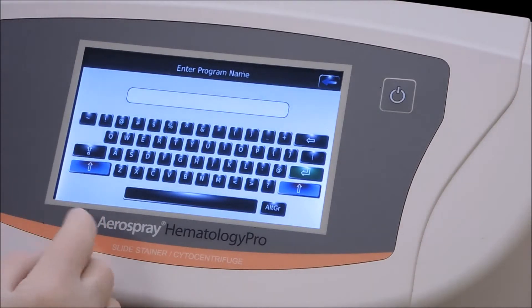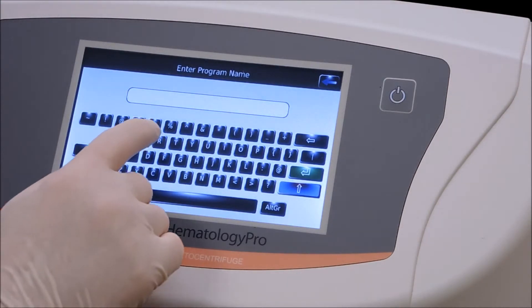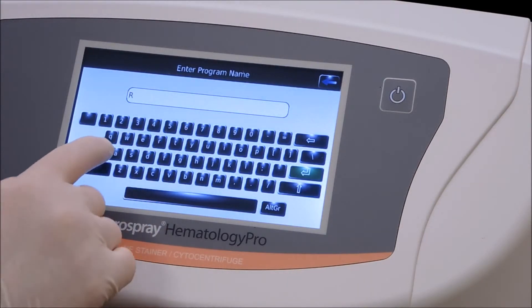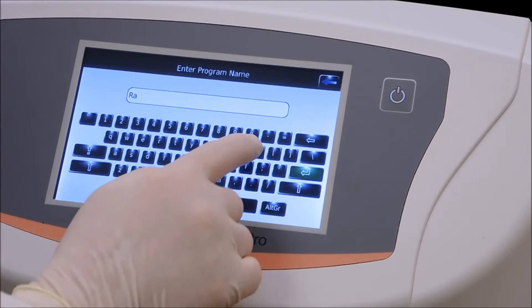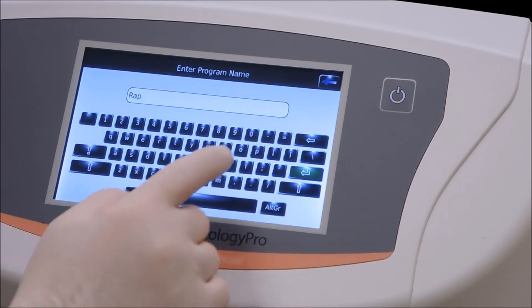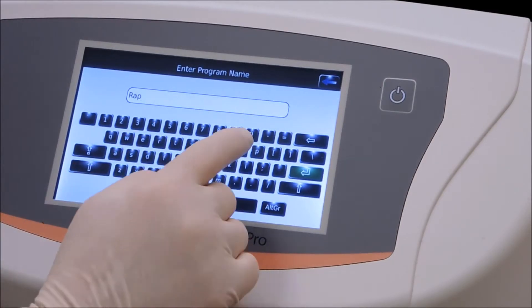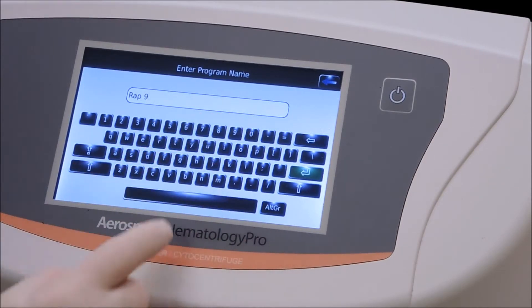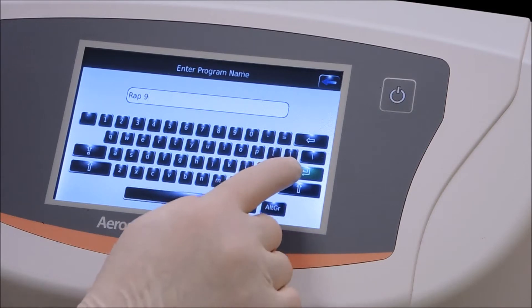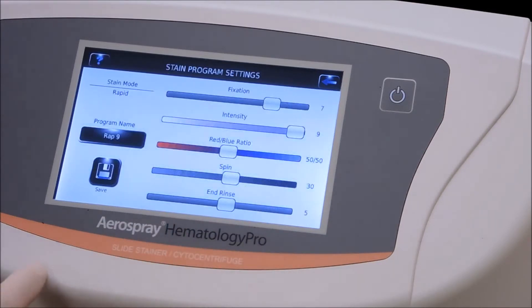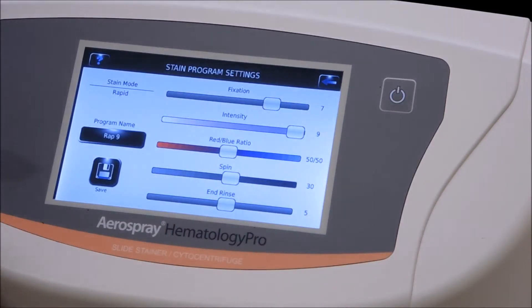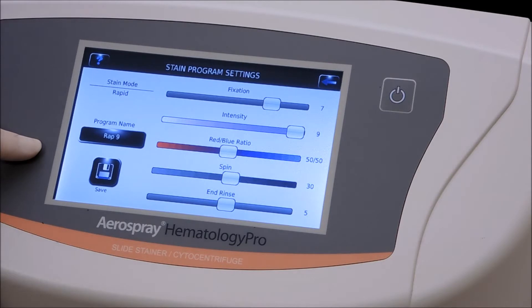Now we need to enter the name. Push the enter space — we'll type R-A-P and then a space. Now we've named and identified this program that we're going to use.